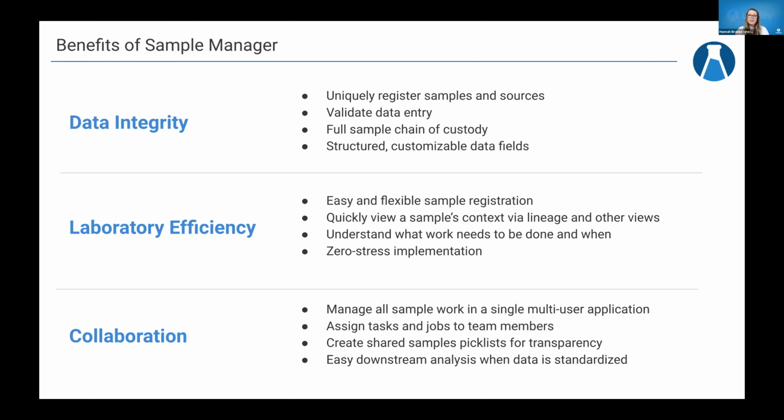And finally, collaboration. So managing all of your sample work in a single multi-user application. A quick side note, when I first started managing samples for my CAR T-cell immunotherapy trials that I was part of, we were using Excel, which quickly became very hard as soon as two of us needed to open the same Excel file. Then we moved to Google Spreadsheets, which was not only not IT's favorite way of tracking our samples, but it also turned out to be a complete mess. So having all of your sample work in one place where multiple people can be working in the lab at the same time was really important to us.